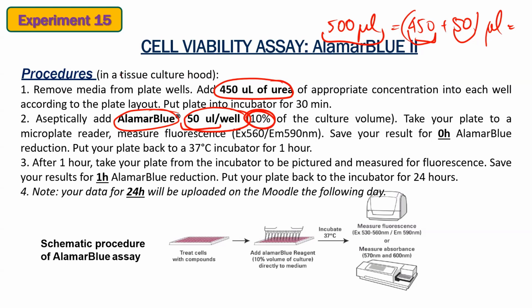Okay, so we do everything in a tissue culture hood. Otherwise, you have a chance to contaminate your incubator, because you do use the incubator in this experiment. And if you contaminate it, then there are lots of problems for everyone in the lab. So please don't do that. If it needs to be done in the tissue culture cabinet or hood, please do it there.